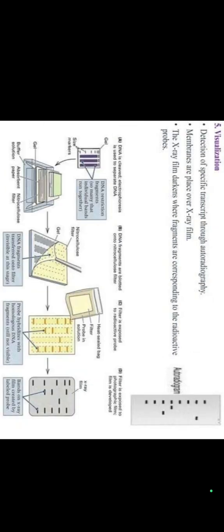Northern blotting was developed by James Alwine and George Stark at Stanford University. Northern blot involves the size separation of RNA in gels like that of DNA, because we wish to determine the native size of the RNA transcript. Steps involved in northern blot: RNA isolation, separation by electrophoresis, transfer of RNA to a membrane, hybridization and washing, visualization.